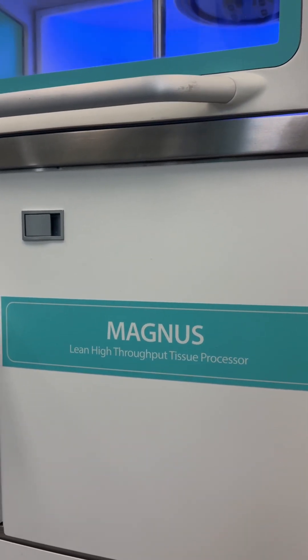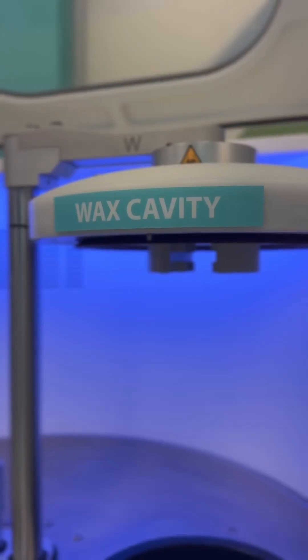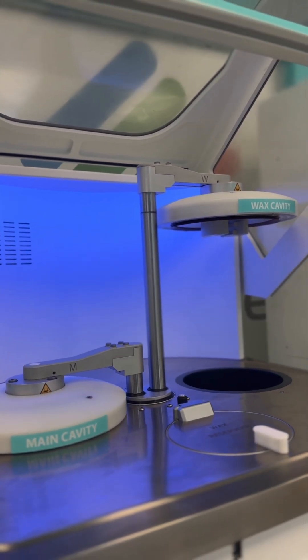Then we take the samples over to Magnus, our tissue processor, for processing. This involves dehydration, clearing, and infiltration with paraffin. Milestone processors are unique because we use xylene-free processing, which is a safer alternative for the tissue and the techs that are handling it.